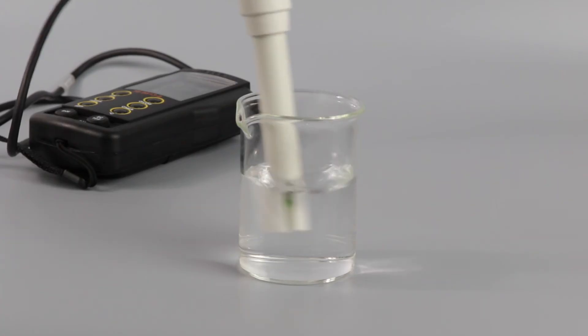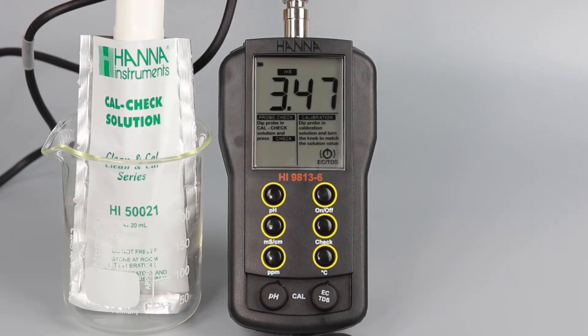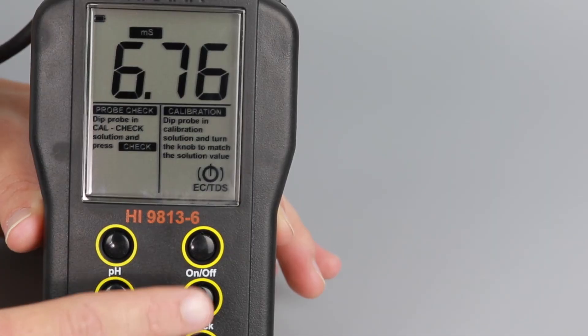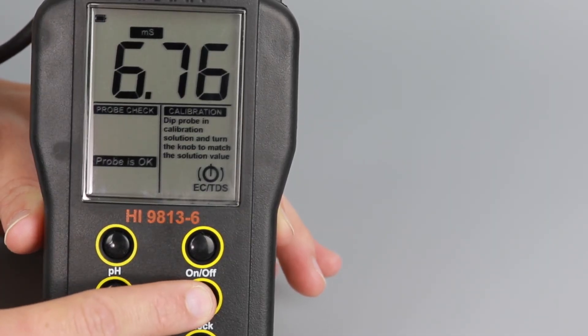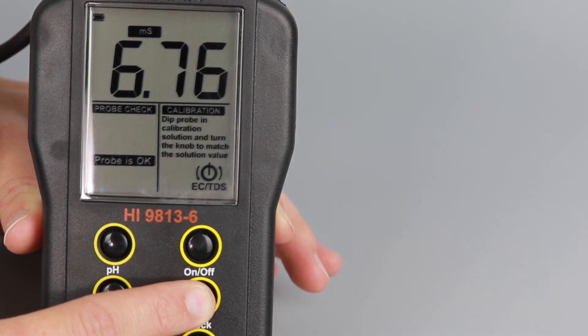If you ever need to check the meter status, CalCheck allows you to do so with a quick and easy procedure. Simply rinse the probe with pure water and then submerge it into your HI-50021 check solution. Then press the check key. If your probe is in good working order, 'Probe is OK' will be displayed. Otherwise, simply follow the instructions on the screen to get your probe in good shape again.